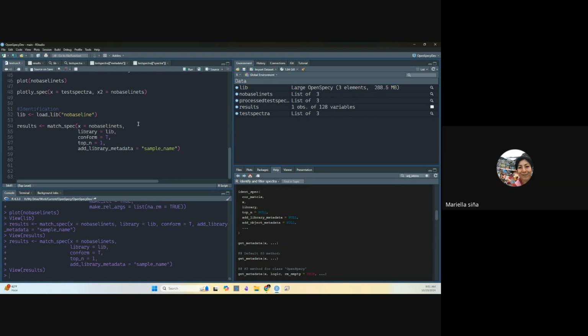Yeah, I think it was the spectra that I told you, from the Raman, that identifies everything as dyes. So all of them were the same indigo dye. So I stopped trying after I got the error. Yeah, but I will send you a message.